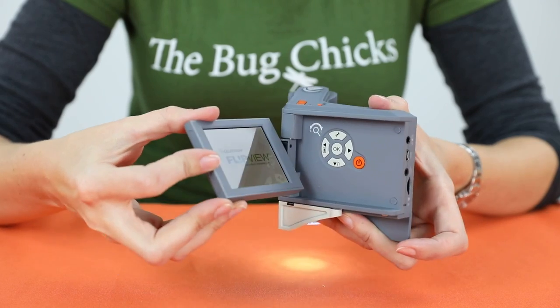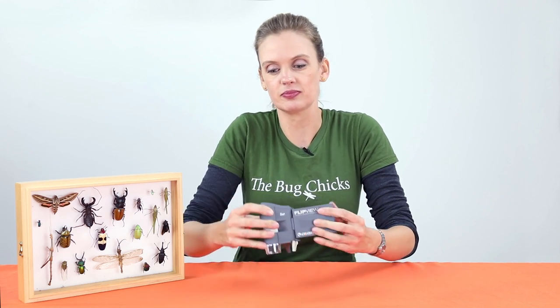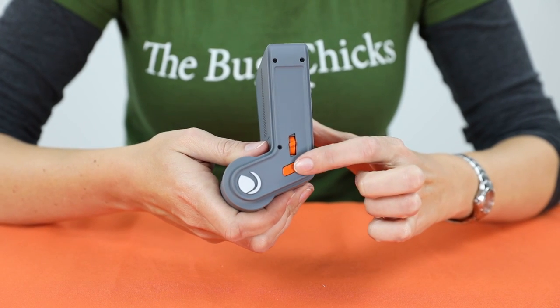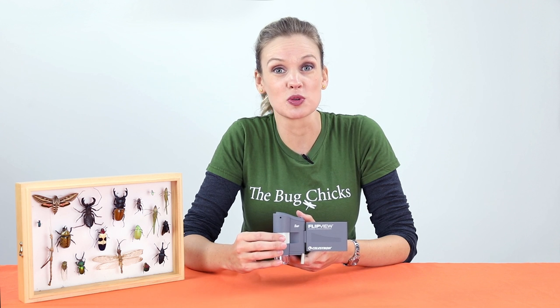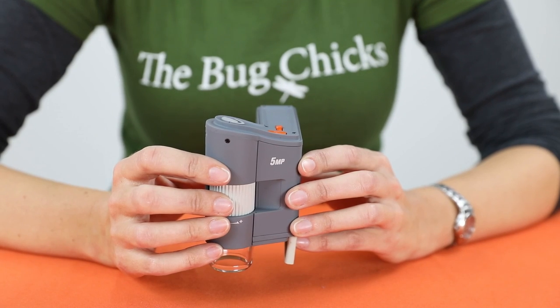Open it up to turn it on and you have this LCD screen. It tilts so that you can see it in the sun. On the top you have your photo button — that's where you take a picture. You've got a zoom toggle, and in order to make sure that you get the sharpest, most in-focus photos, you've got this focus barrel right here on the front.